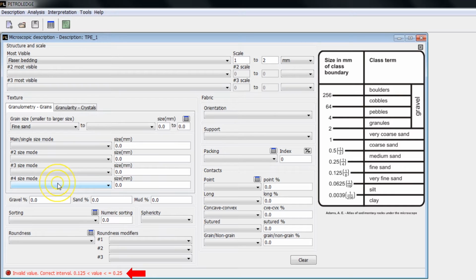Likewise, if the nominal grain size entered in the cell intended for the higher grain size is less than the first grain size recorded, it also issues a notice in the footer. In the lower portion, you must insert the overall percentage observed visually through a scan taken on the slide of its content of gravel, sand, and mud.